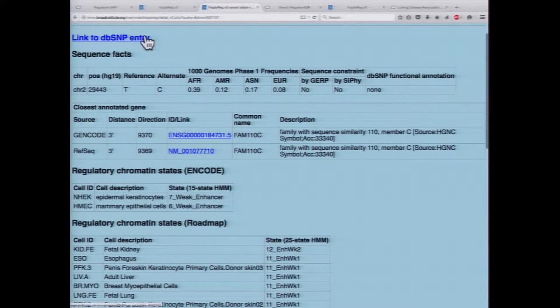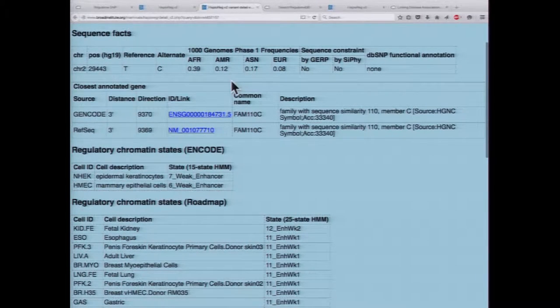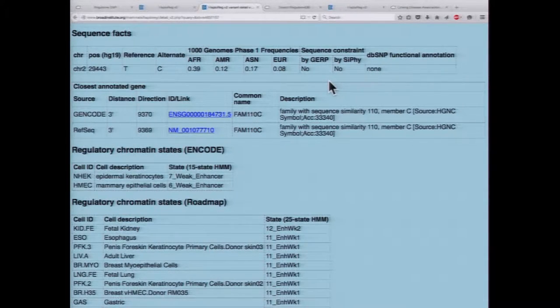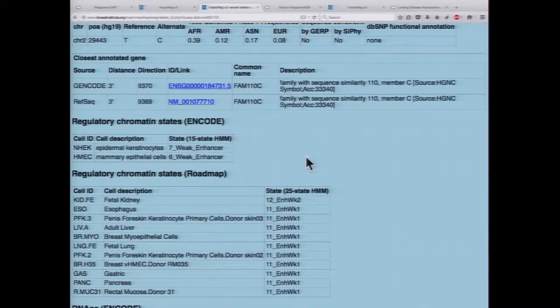You have links to dbSNP and a nice summary of different sequencing features: the position on the genome, the reference allele, the alternative allele, and the minor allele frequency in different populations from the Thousand Genomes Project. You also have different conservation scores, and if there's a functional annotation in dbSNP — for example, if it's been annotated as a missense or sense mutation. You also have data about the closest annotated gene, with information for both GenCode and RefSeq genes, and whether it's upstream, downstream, or within the gene itself.